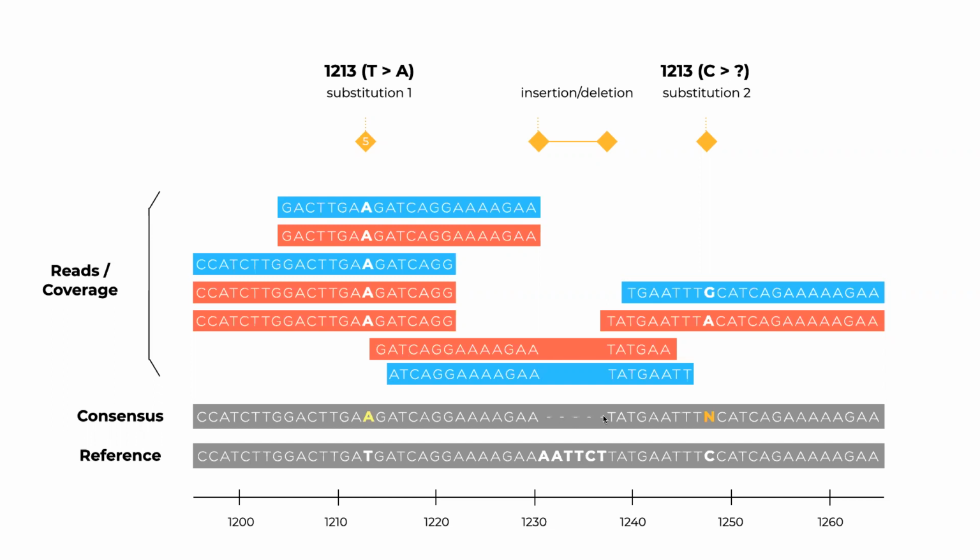And we'll take a look today at some of the examples so that we can identify how specifically these different examples or samples differed from the reference. Now, because we took 3 different groups, we are talking about 3 different consensus genomes. Essentially, we will have a consensus for each group of samples and how that is different from the reference genome.